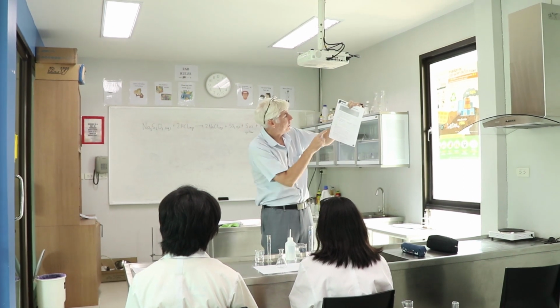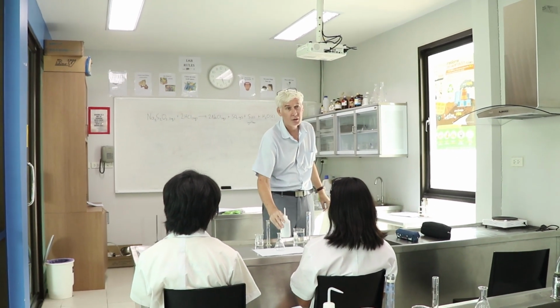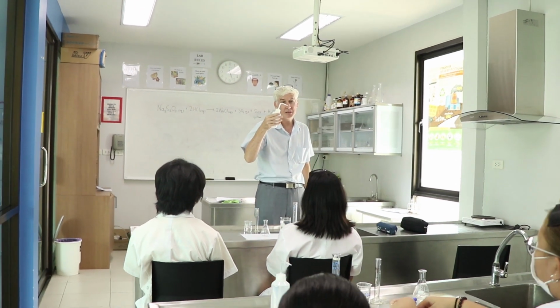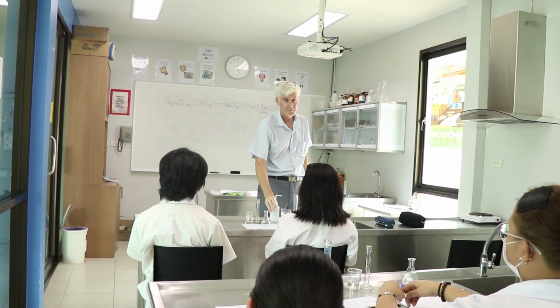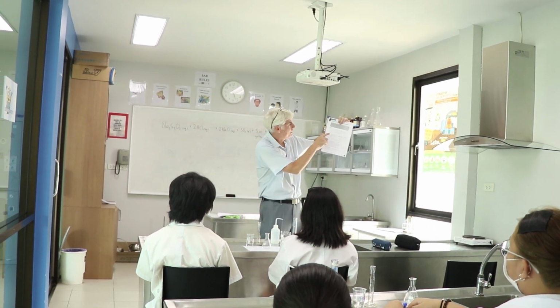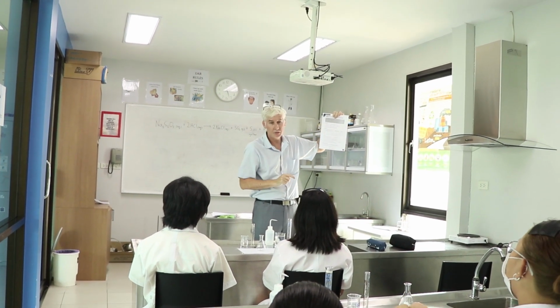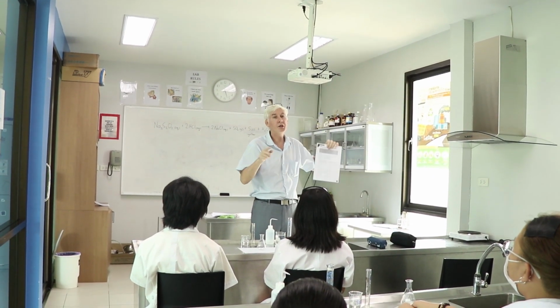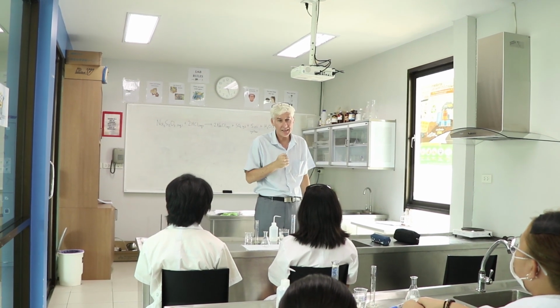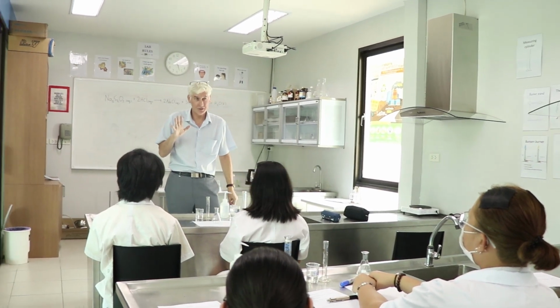The next time you're going to add 40 cubic centimeters of thiosulfate, and you're going to top it up with 10 cubic centimeters of water. Yeah? Put it in the flask, redo it, time it. So each time you're going to make the thiosulfate more and more dilute. When you record it, round off to the nearest second. Does that make sense? Any questions?